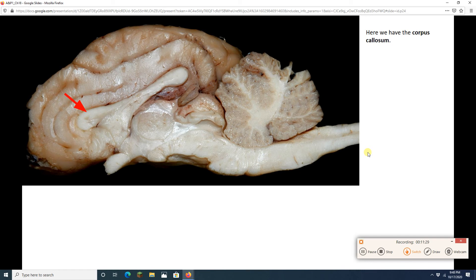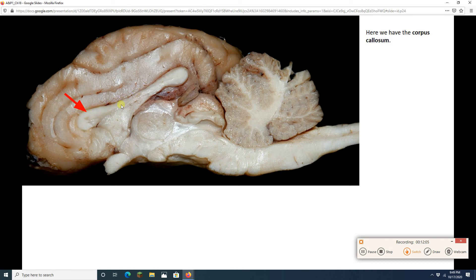What we've done now is sliced it mid-sagittally. We made a beautiful mid-sagittal slice. We can still see the cerebrum up here — check out that beautiful cerebrum, with the same lobes: frontal, parietal, occipital. We can see our diencephalon right in here, our brainstem, spinal cord, and cerebellum. That white thing right here is the corpus callosum — we know that is a very large group of commissural fibers connecting the left and right cerebral hemispheres.